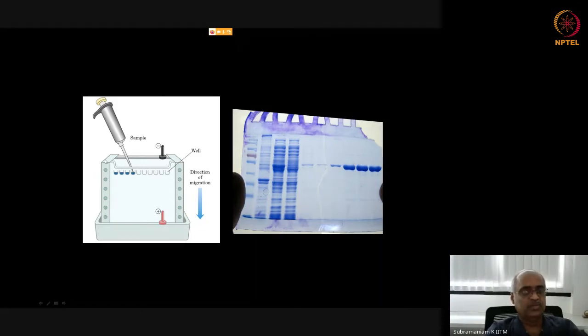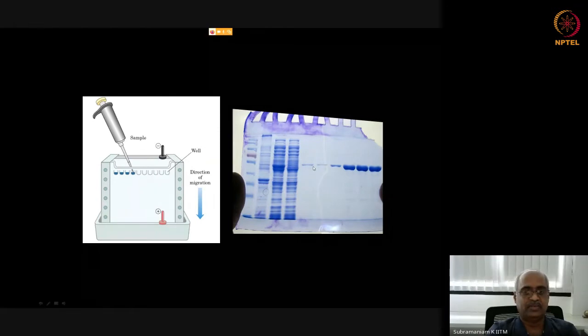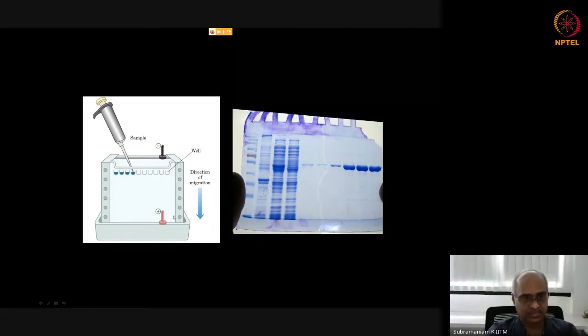That is usually 1 millimeter to 1.5 millimeter, so the space between the two glass plates is about that much. Maximum we usually use 1.5 millimeters, and in some preparatory versions they might use 3 millimeters. What we commonly use for separation, to get a gel like what is shown on the right, is about 1.5 mm spacers. These plastic strips shown here are the spacers, between the two glass sheets.